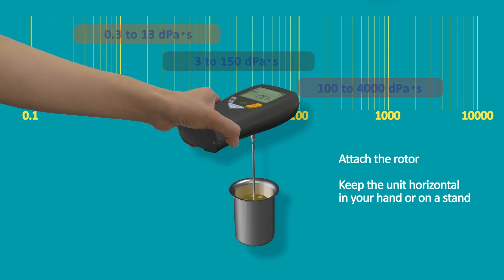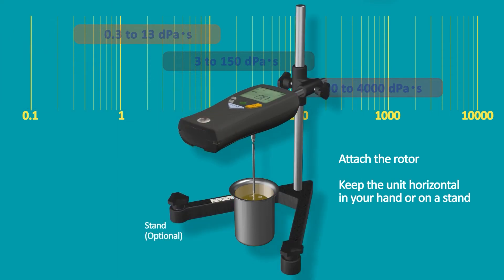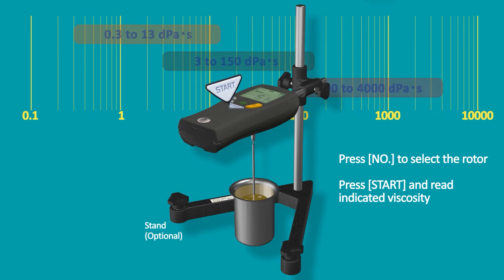Attach the rotor. Keep the unit horizontal in your hand or on a stand. Press number to select the rotor. Press start and read the indicated viscosity.